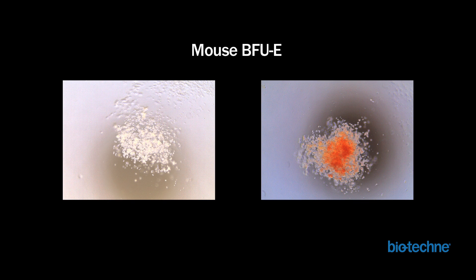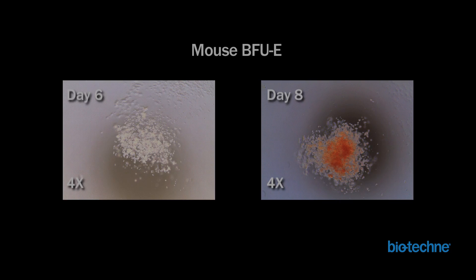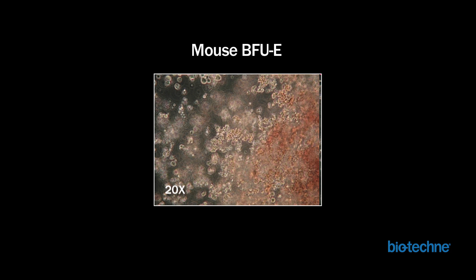Mouse BFU-E colonies have a slightly different morphology compared to human cells. In these two examples, mouse BFU-E colonies are more tightly clustered and have a less intense red color. The red color will vary depending on time in culture — colonies observed on day 6 of the assay will be brown or tan, as shown in the figure on the left, while those on day 8 will be significantly more red, as seen in the image on the right. At a higher magnification, one can visualize the characteristic appearance of BFU-Es as very small, tightly packed clusters of cells.